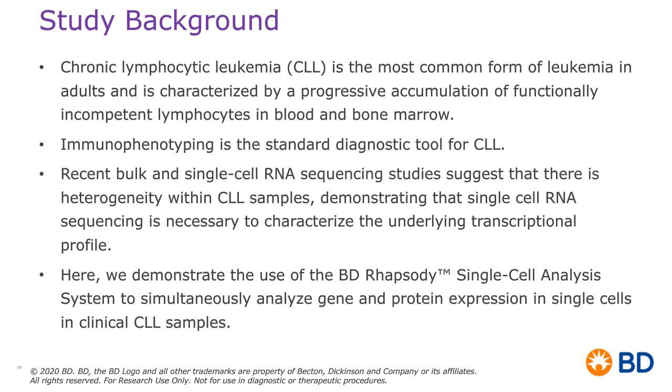So it indicates that there's value in evaluating the mRNA information as well as the protein profile to understand the unique differences in these CLL populations. Here we're going to demonstrate the use of the BD Rhapsody single cell analysis system to simultaneously analyze protein and gene expression in single cells in clinical CLL samples.